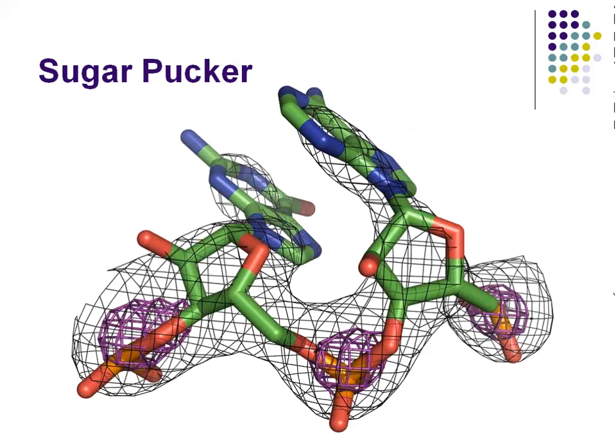The other thing I mentioned is the base phosphate perpendicular distance, and that's basically a way of determining sugar pucker. I mentioned before, if you're looking at typical RNA density, trying to pick out the sugar pucker is really difficult and many times just absolutely impossible, especially when you're working with experimentally phased data. In this map, you can see that the sugar should go somewhere in here, but trying to figure out exactly which atom is out of plane is nearly impossible.